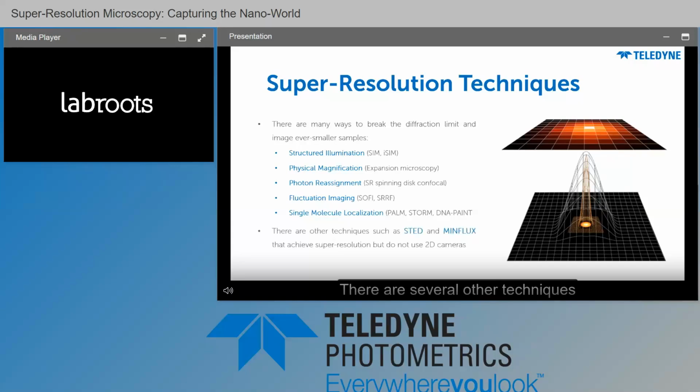There are several other techniques for super resolution, such as STED and MINFLUX, that achieve super resolution, but these typically don't make use of 2D area scan cameras. They often use point detectors, so I won't be covering them in this webinar.